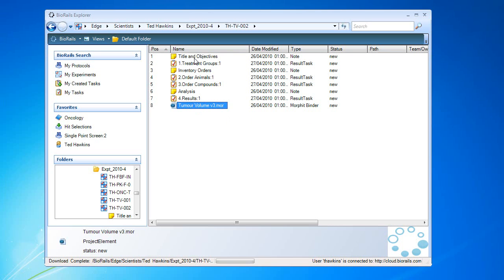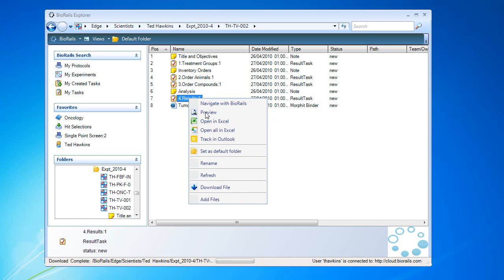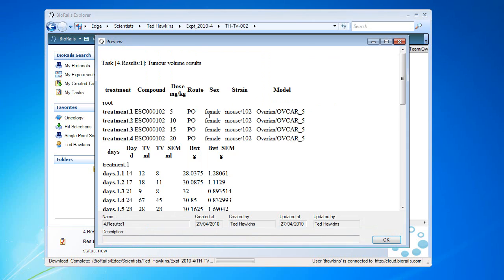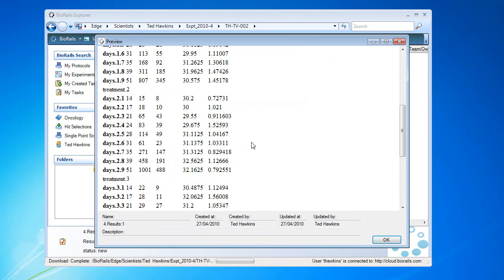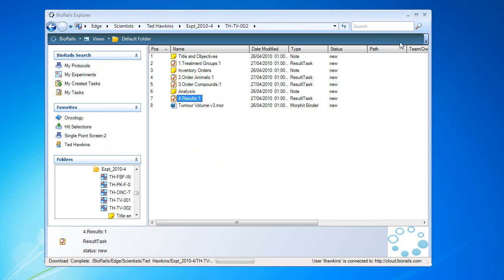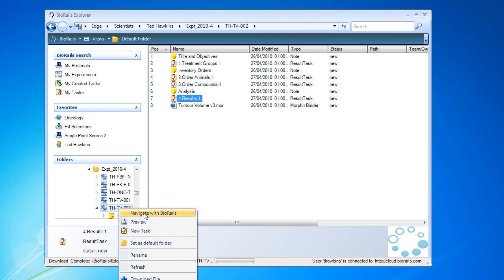Here's the experiment. We can preview, look at the results. This is the data that's gone back into BioRails. And of course, we can open the experiment in BioRails.